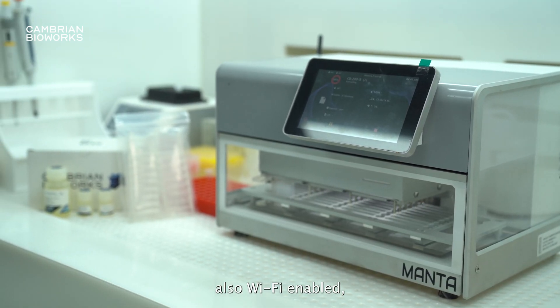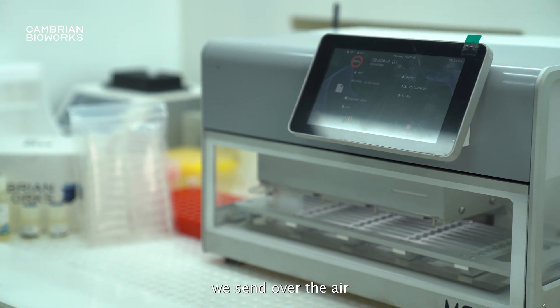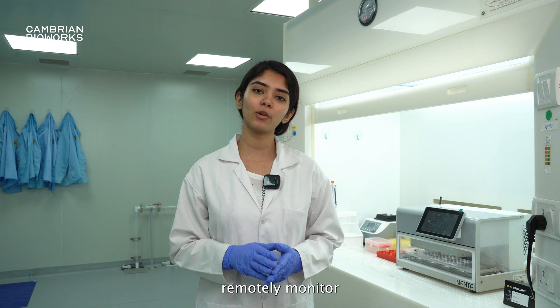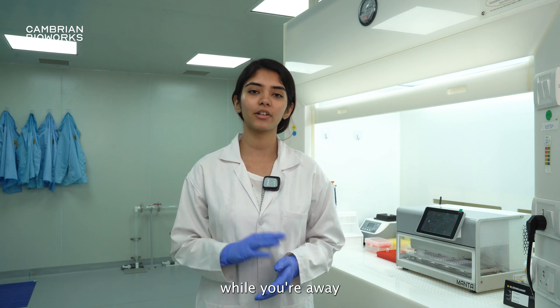Manta is also Wi-Fi enabled, which means that every time we send over-the-air updates, you can download them in your machine. Along with that, you can remotely monitor your run status while you're away from the machine.